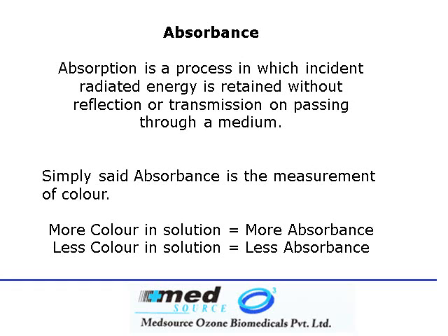5 drops of ink, low absorbance. 20 drops of ink, certainly more amount of absorbance, and 50 drops of ink, a lot of absorbance. If you know how much absorbance, you can measure how much ink and vice versa.